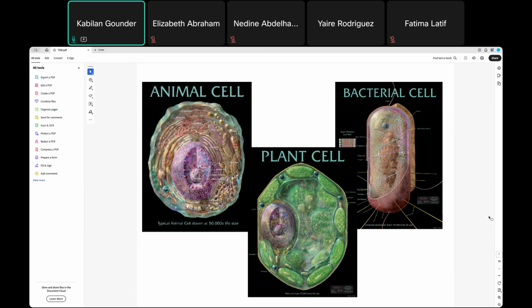Maybe later, if we have more time, I will show other information related to how we can get different signals, and also what kind of information we get through this apart from the structure. So the scanning electron microscope, as we discussed, is important, and the information you get from it you do not get from the light microscope. The main two reasons are resolution and high magnification. Those are the two most important things.